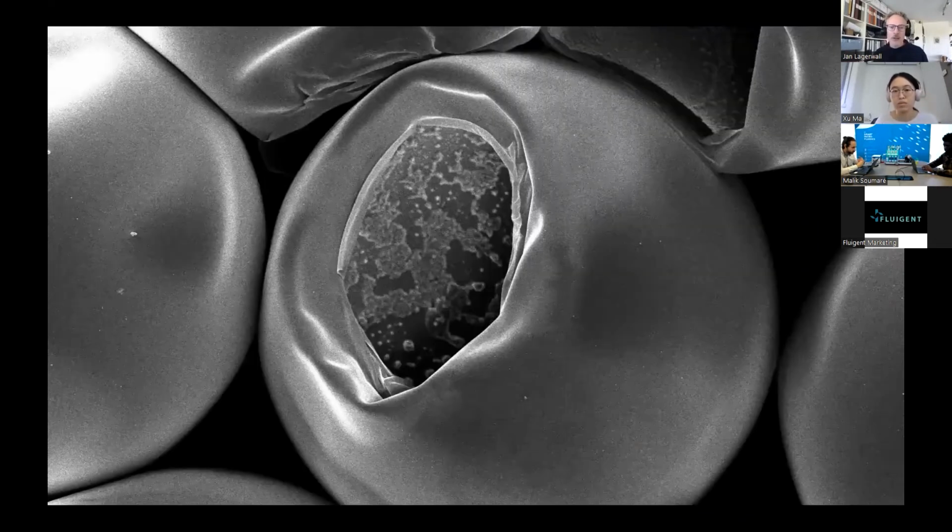Well, that's because we need a stabilizer for making the shells using microfluidics. And in this case, it's polyvinyl alcohol, or PVA. And PVA isn't soluble in acetone. So it makes this layer of crystalline PVA or amorphous PVA on the inside and on the outside. And on the outside, in this case, it's gone because of the first washing with water before adding the acetone. But on the inside, it remains.